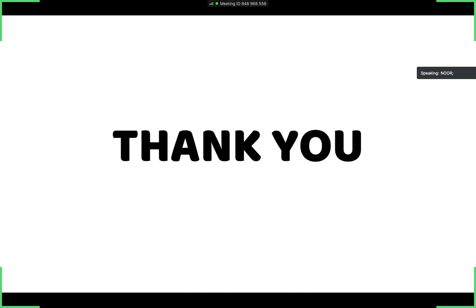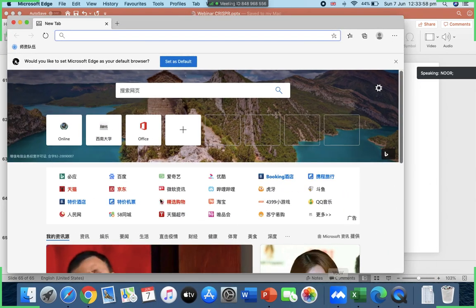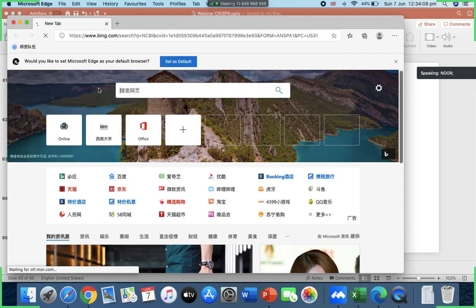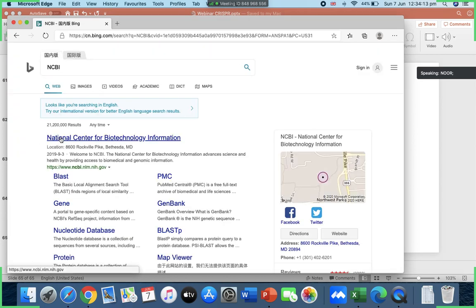And now we are going to go to the NCBI, and the gene of interest I have told you is what? GATA1. So first of all, I will open the NCBI website, National Center for Biotechnology Information.